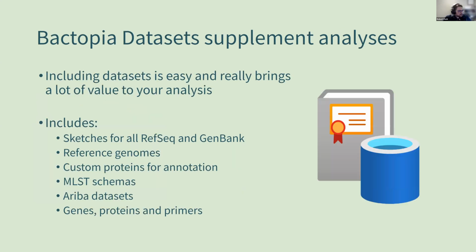Now, the Bactopia datasets supplements your analyses. It includes datasets that are really helpful to bring more to the table. It includes sketches for RefSeq and GenBank, reference genomes, custom proteins for annotation, MLST schemas, Ariba datasets, genes, proteins, primers, you name it, you can throw it in there.